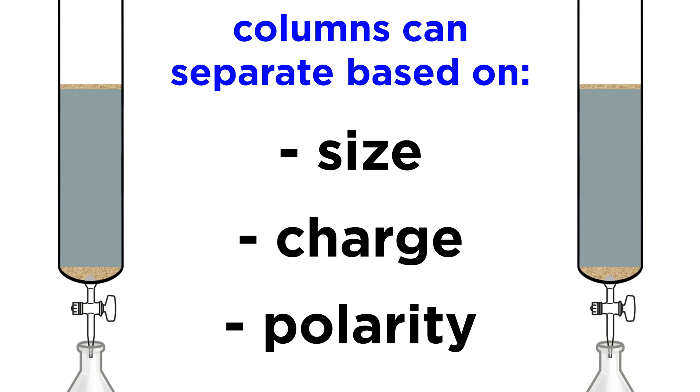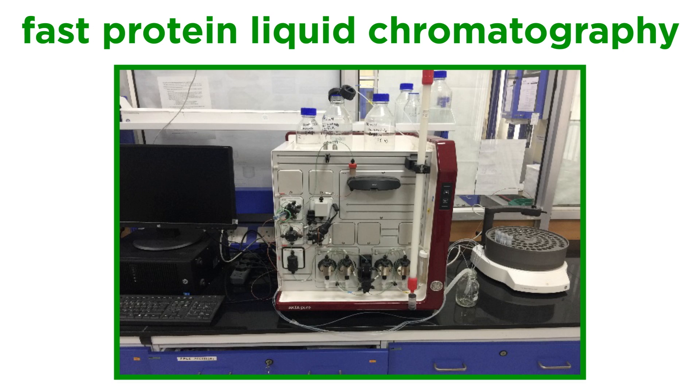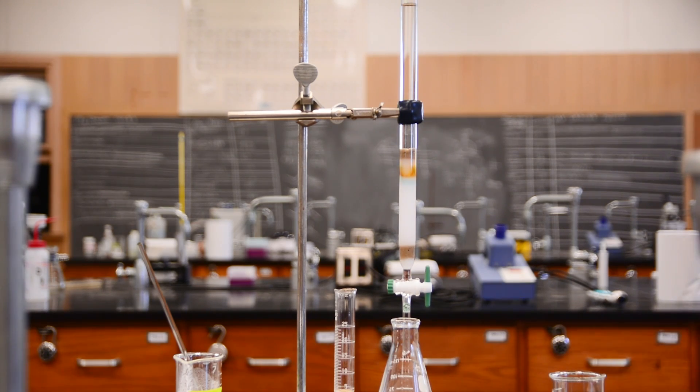In the lab we can use columns to separate things such as peptides or drugs based on aspects such as size, charge, polarity, or other affinities. The packing, mixing, and collection of these can also be automated in large-scale academic and industrial processes. A sophisticated example of column chromatography is FPLC, or fast protein liquid chromatography, a technique that is used to separate proteins. But for now that concludes an introduction to column chromatography.